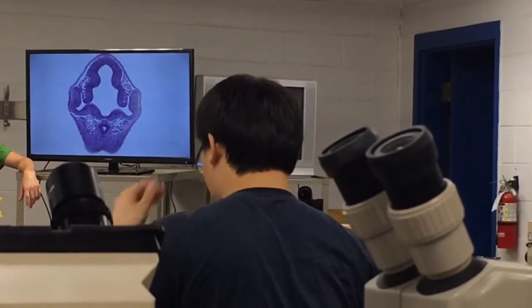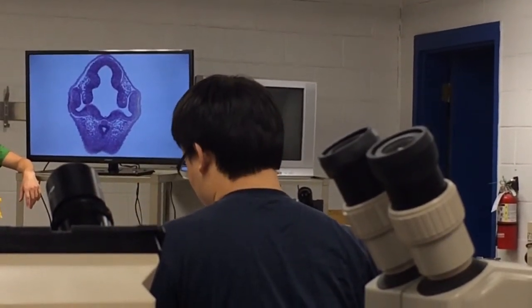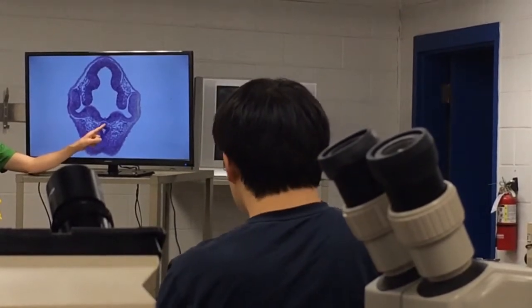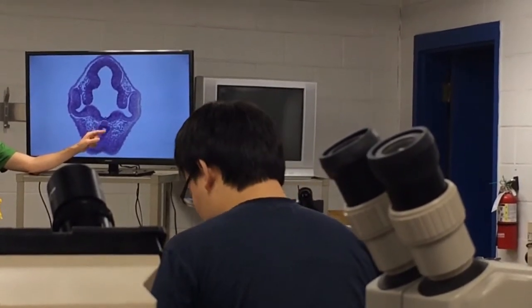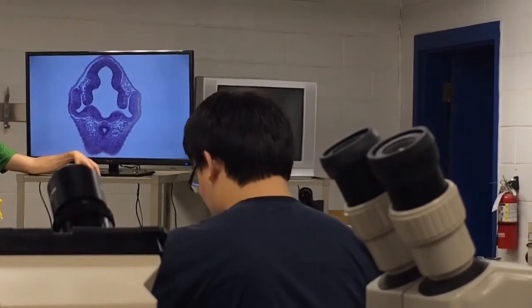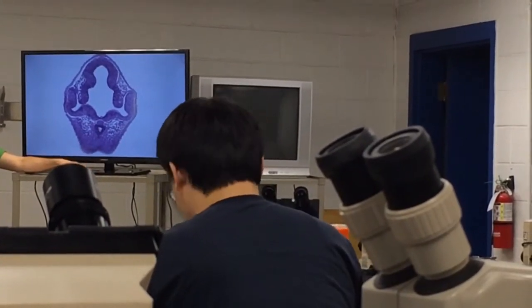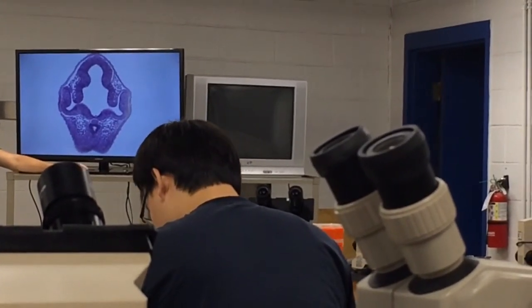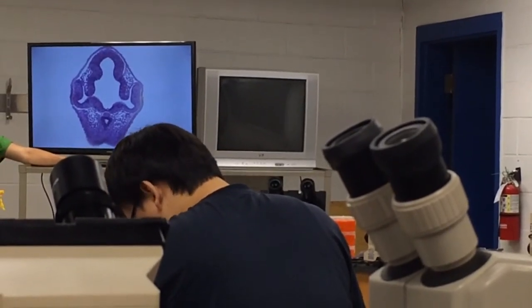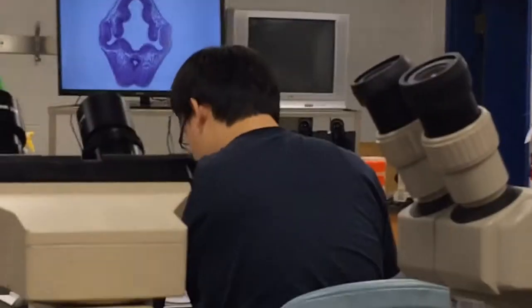Where's the adenohypophysis versus the infundibulum? Touch adenohypophysis. Look at it. Right there is the adenohypophysis. Okay. So in that section, there's a lot of information. It's a good deal of information. I'm going to stop talking for a few minutes. You'll find another good section.